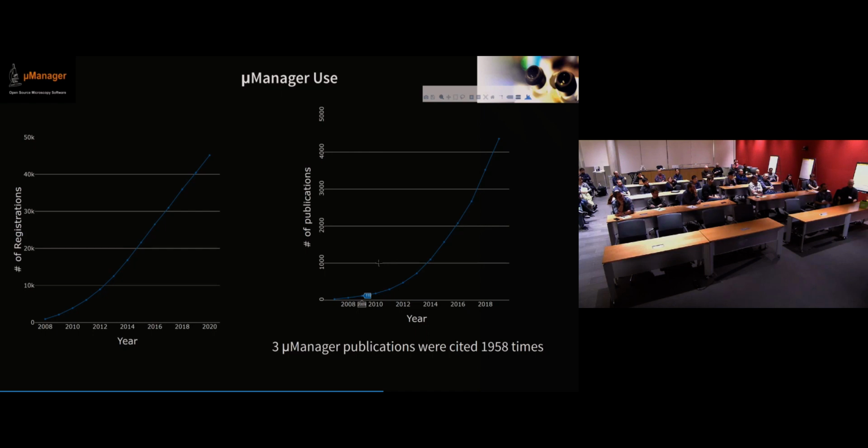It's almost a more interesting question at this point what the type of users are. I think there's a significant chunk of people who could also have used commercial software to run their microscopes, but they don't want to pay $10,000 for software that just grabs images from a camera and opens and closes a shutter for them, because that's often what it costs for something simple like that.